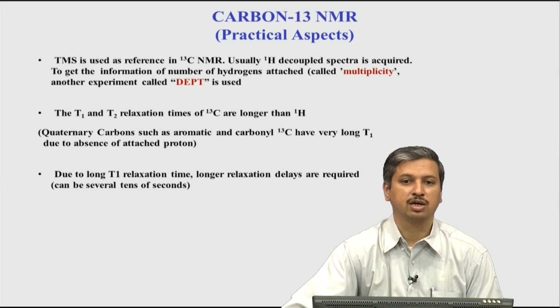So, if you record a 1D NMR spectrum, remember we apply a pulse and then we record a FID, then we have to wait for some time before the molecule relaxes back to the full equilibrium situation, then you apply the next pulse. So, this cycle of applying a pulse, recording the data and a delay so that it comes back to equilibrium is repeated a number of times, that is called scans.